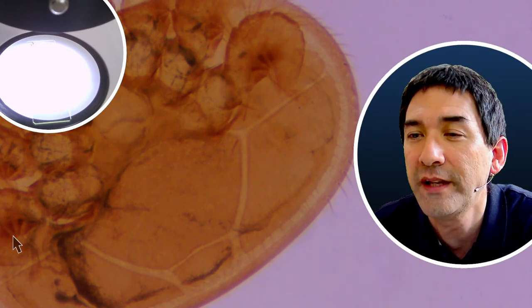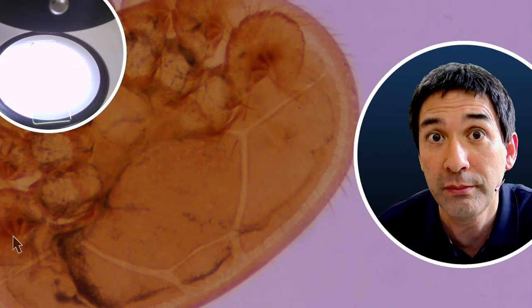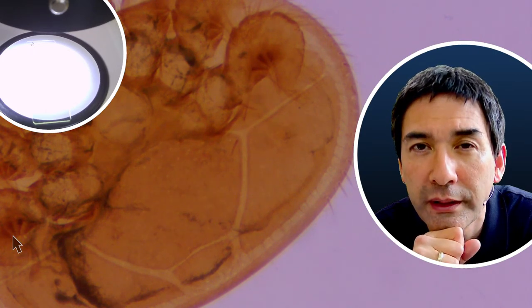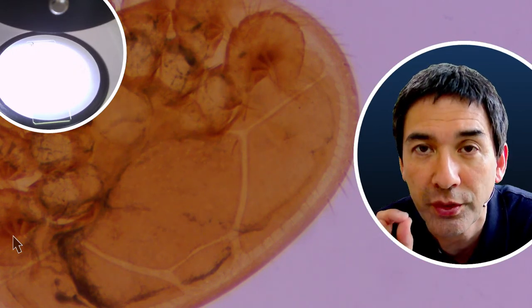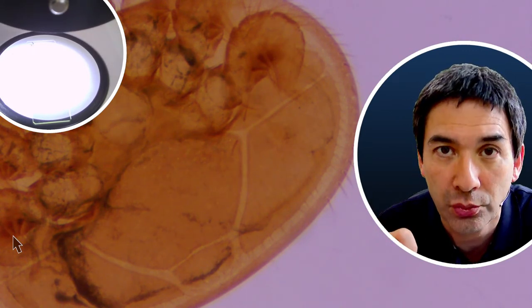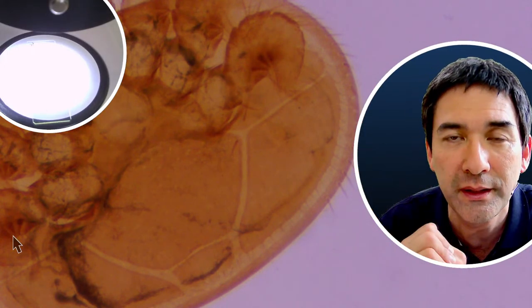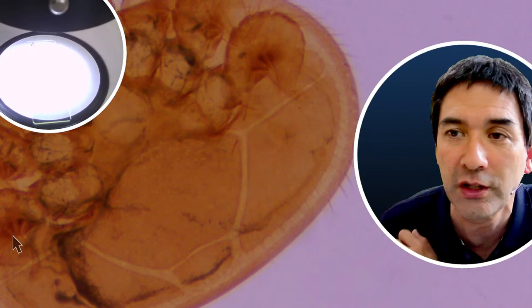Do you put mold under the stereo microscope? Yes, I've done this. I don't have mold here right now, but a couple of years ago in this channel I put a toast with mold — some black mold — under the stereo microscope. Search for 'moldy toast under the microscope' or 'rotten tomato under the microscope' in this channel. I made it a couple of years ago so you might have to go back in the video history.